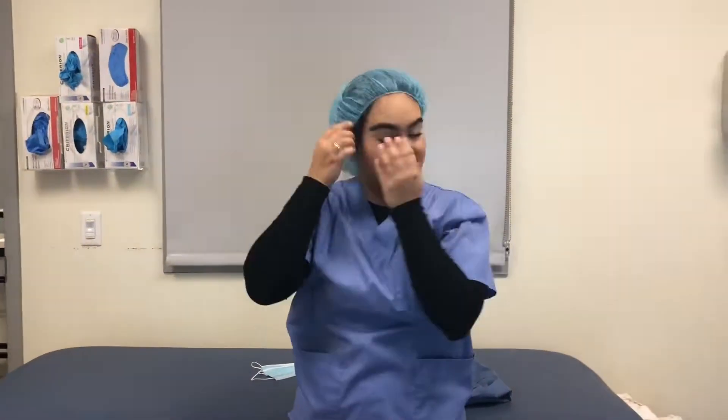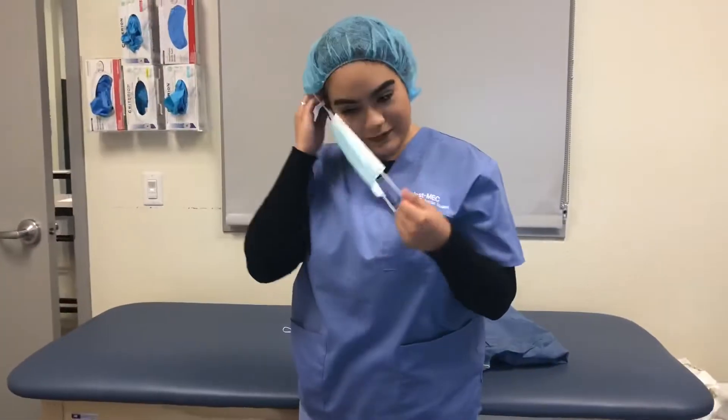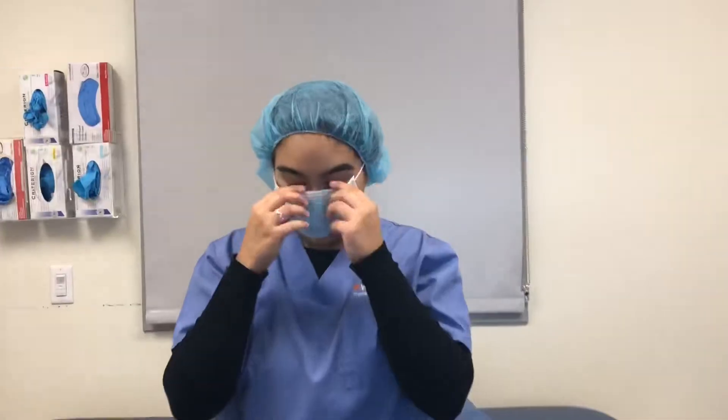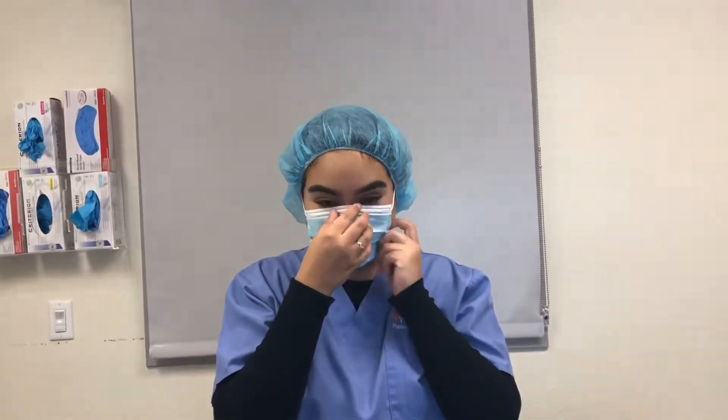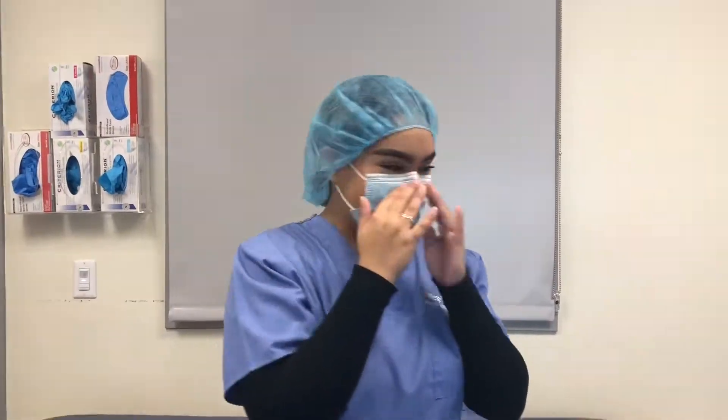Assure that all earrings and accessories are off. Put the mask on over each ear, then put the bonnet over your ears. Make sure the mask covers your nose — bring it to the nose so the metal conforms to your nose shape.